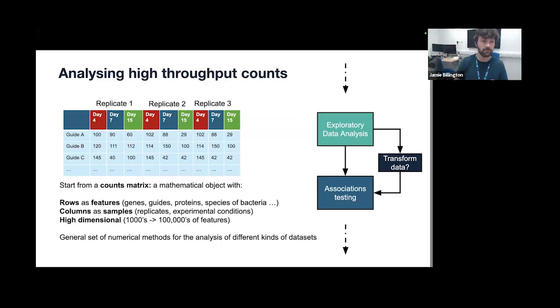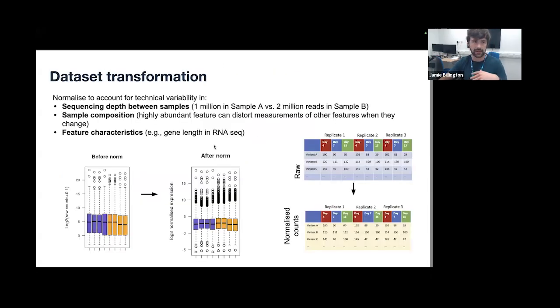And that's what we'll be basically walking through today. To run through these at a high level, one thing we'll be doing is normalizing our data set. If you're someone who works in the lab, you may have normalized DNA concentrations. Normalization is something that we also apply in the world of bioinformatics.